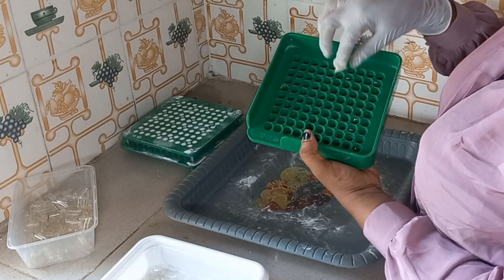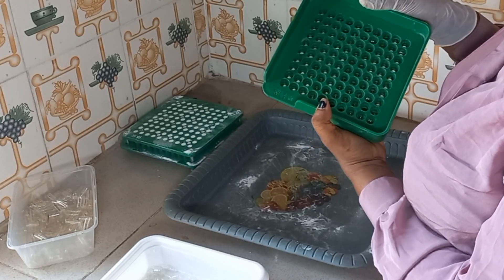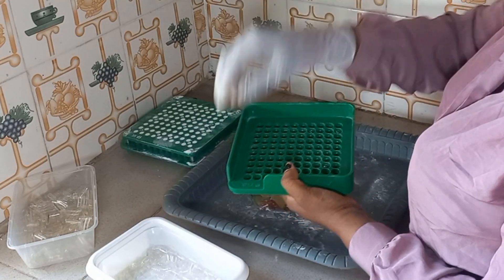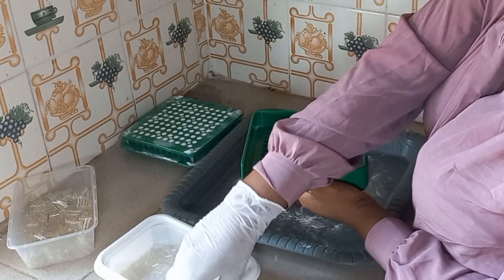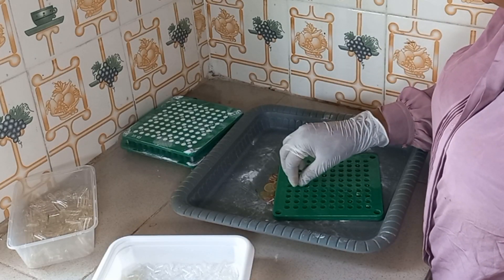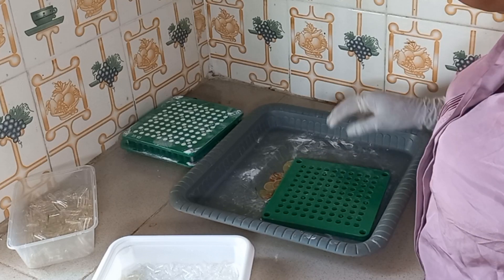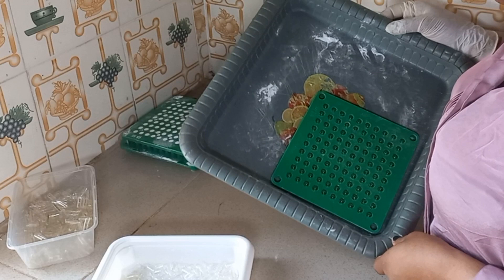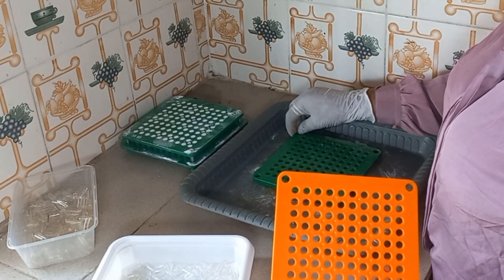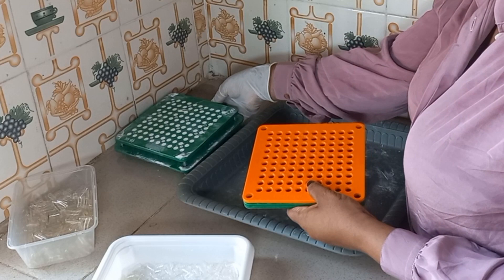Now we check if everything is properly done. Some are upside down — that one is inside down, and that one is outside down. Everything is set, so the next step is to use this one to place it like this, then like this, and then like this.